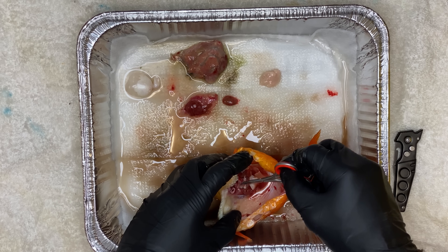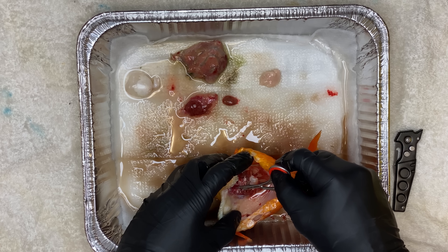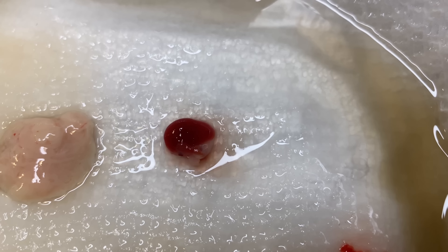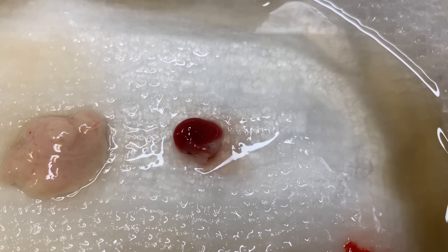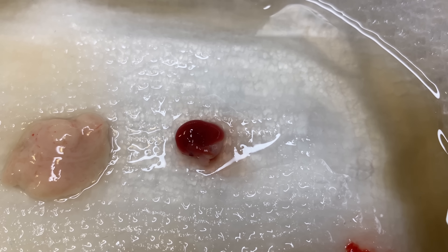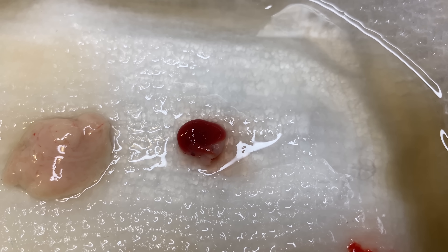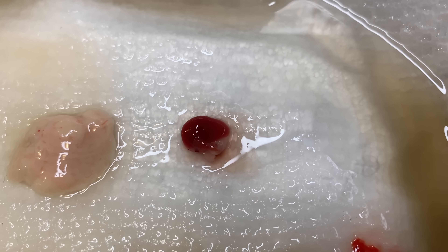Now you can see me removing her heart. Don't be alarmed, but the muscle cells in the heart can continue to contract well after the fish is dead. So you'll see that heart on this paper towel just beating. Those muscle cells can continue to contract even after the fish is gone. It's a little interesting, but also kind of creepy and weird.